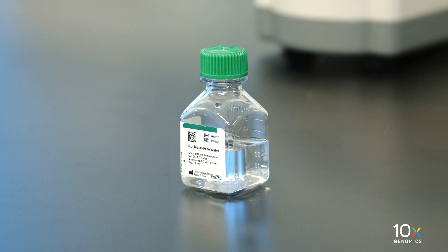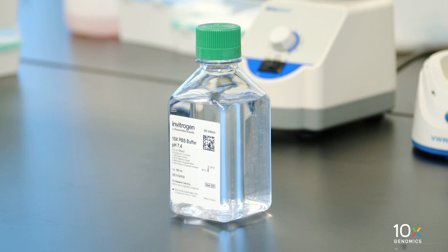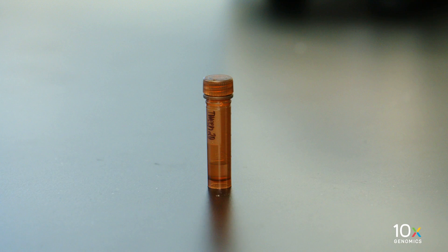We have nuclease-free water, 10x PBS, and 10% Tween 20. We are ready to prepare the pre-hybridization mix.